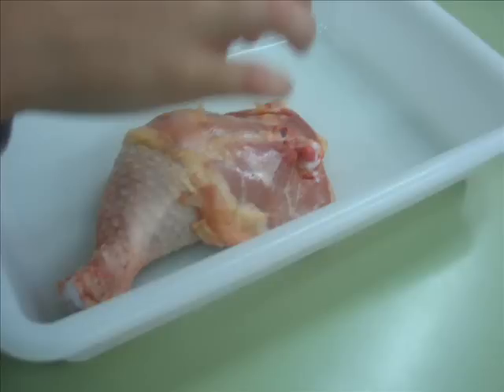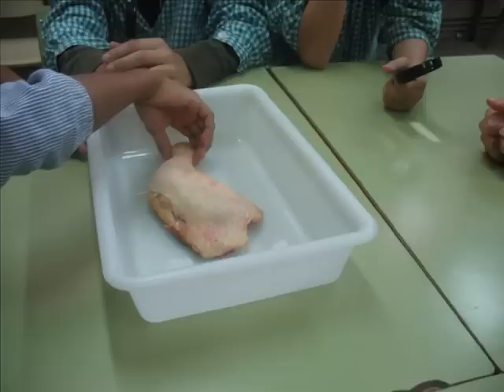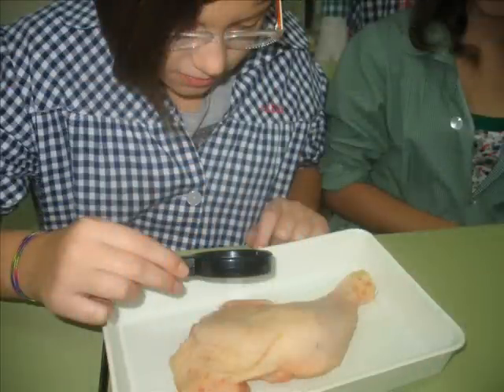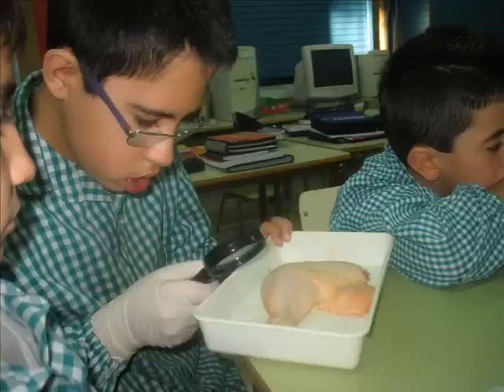First, put the chicken leg in the top. Turn over the chicken leg and observe it carefully. Take out the magnifying glass. Put on a glove and observe the skin of the chicken leg.